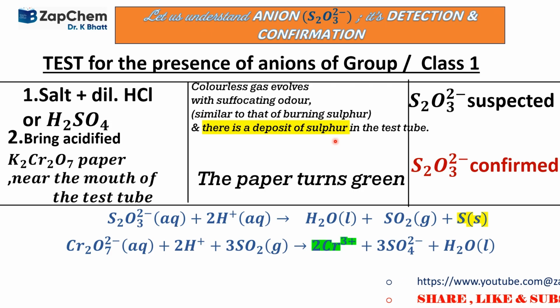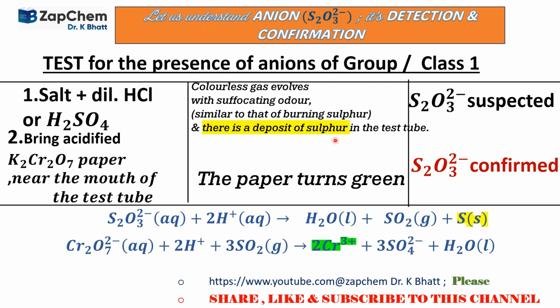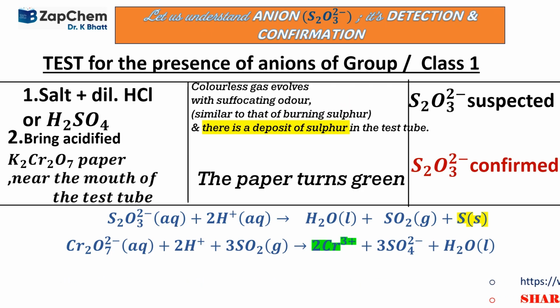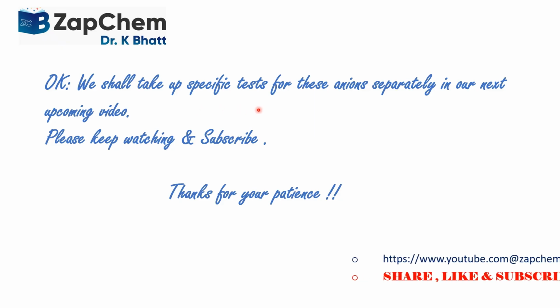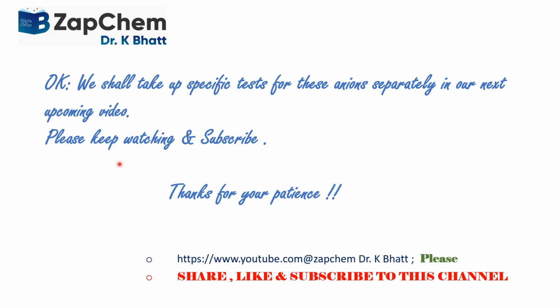And well, it is not the end. There are certain other specific tests of these ions. We shall take up a specific test for each ion separately, one by one, in our subsequent video.